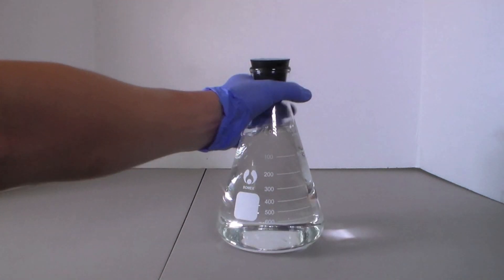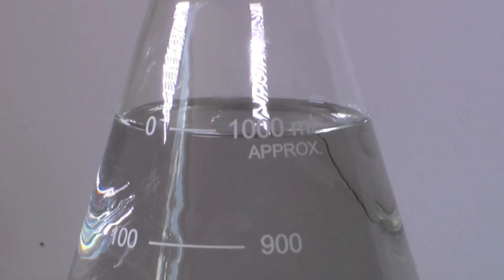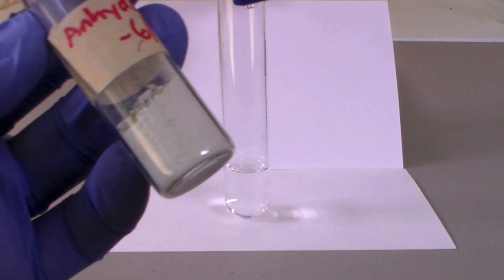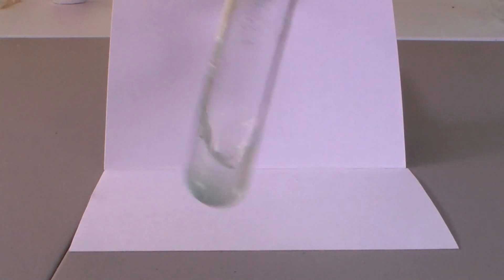I tested the ethanol for water by adding a few milliliters to a test tube and then adding some anhydrous copper sulfate. You can see by the faint blue color that the ethanol still has some water in it.